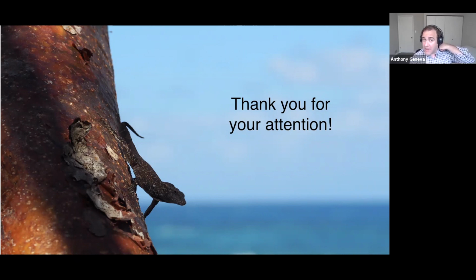size and genome heterozygosity. We're going to estimate heterozygosity the more traditional way, by realigning our Illumina reads to our reference genomes and using SNP callers, GATK or FreeBayes, to estimate heterozygosity. But for the purposes of today's talk, I just used the GenomeScope estimates of heterozygosity.